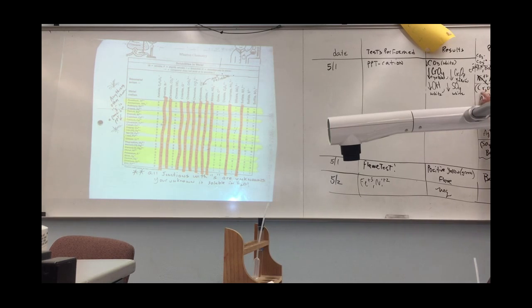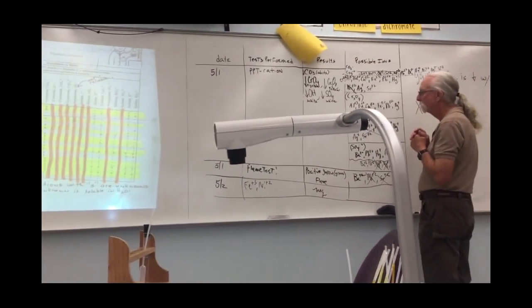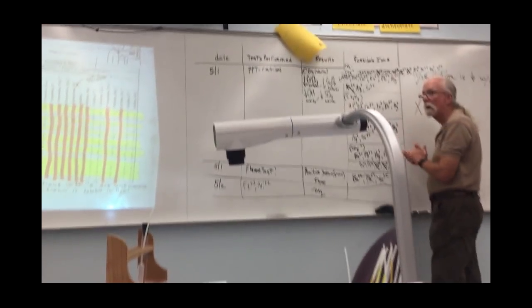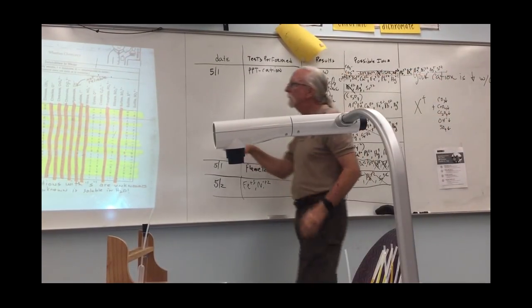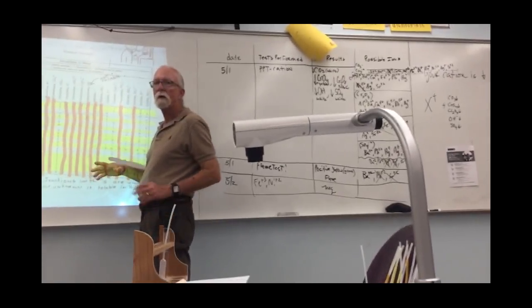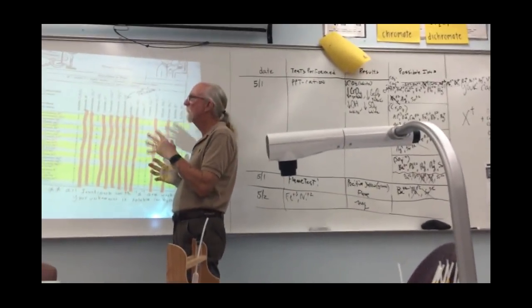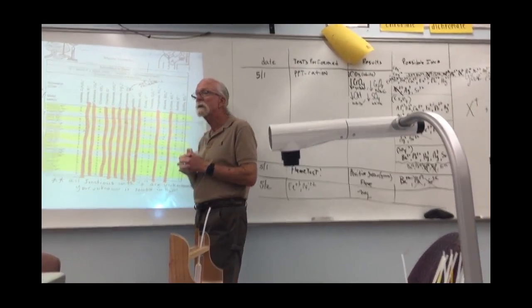Then I go to dichromate. That pretty much is the same. Okay? Now, look at hydroxide right here. Hydroxide, don't trust it. It doesn't work. Bye-bye. Hydroxide doesn't work.